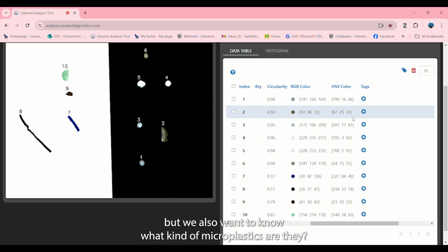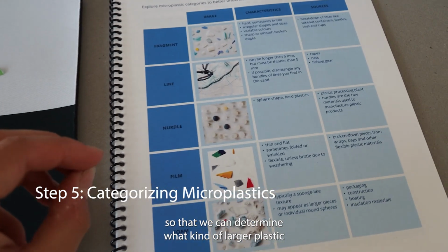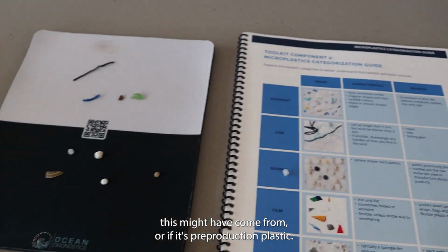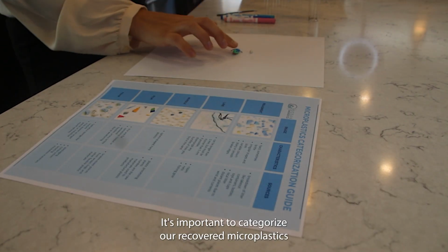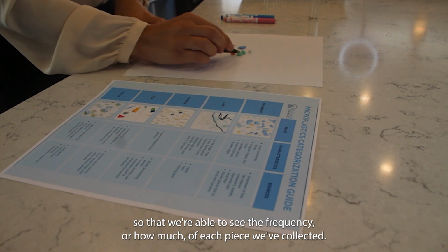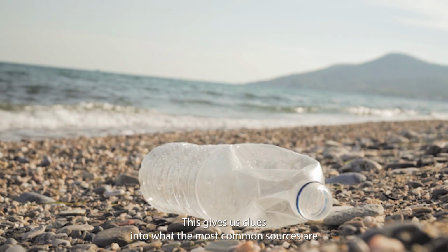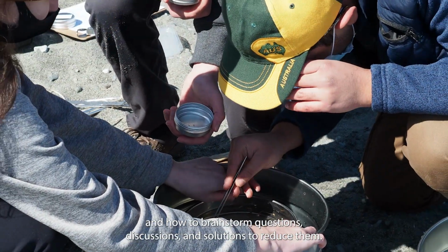It's great that we've collected these microplastics and this data, but we also want to know what kind of microplastics they are. I'm going to use our data interpretation guide so that we can determine what kind of larger plastic this might have come from, or if it's pre-production plastic. It's important to categorize our recovered microplastics so that we're able to see the frequency, or how much, of each piece we've collected. This gives us clues into what the most common sources are and how to brainstorm questions, discussions, and solutions to reduce them.